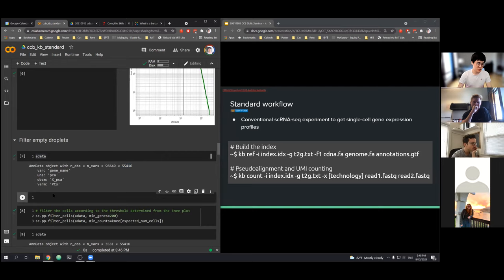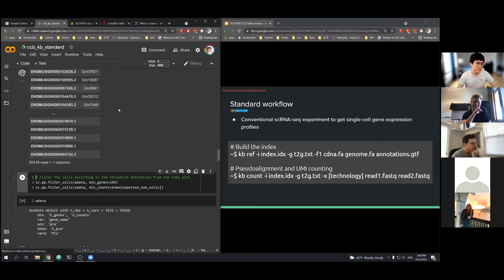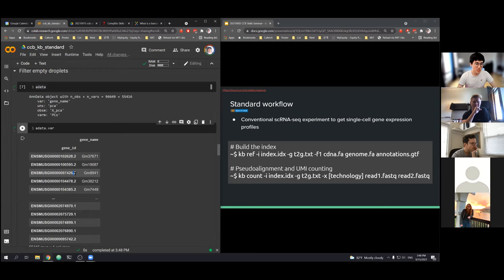We can actually take a look at this in real time. So you see that the dot two, everything after the dot, indicates the gene version. And so to essentially get rid of this, to collapse into actual genes, you would have to just sum the rows that have the same prefix, everything before the period.